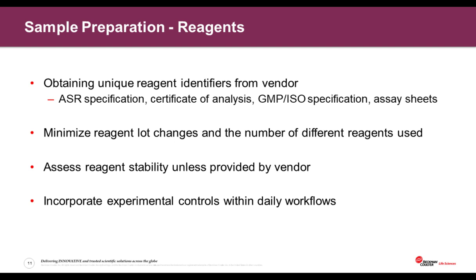Next, we're going to minimize reagent lot changes, and actually we're going to minimize changing any reagents during the duration of the study. So prior to you developing your panel design, make sure you validate and evaluate the panel so that you can lock it in and ask the vendor to lock in the lot. Now, obviously, and most likely, you won't be able to lock the lot for the duration of the entire study, so let's say 3 to 5 years. But what you want to do is to limit the number of lot changes, and this can be easily done.